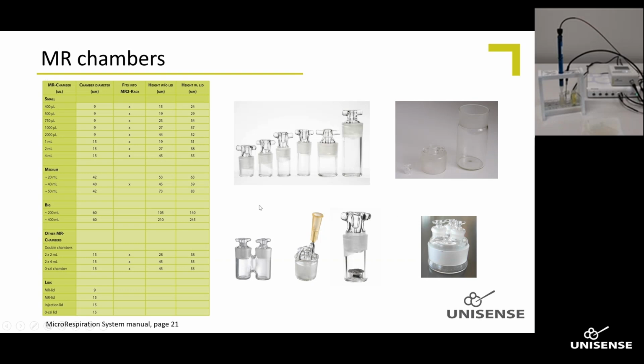Here you can see a picture of the double chamber that I showed you where you can insert 2 sensors and measure in one volume. You can actually also measure in this triple lid that is seen over here to the right. It has 3 lids at the top here, and it's possible to measure with 3 sensors in this chamber.